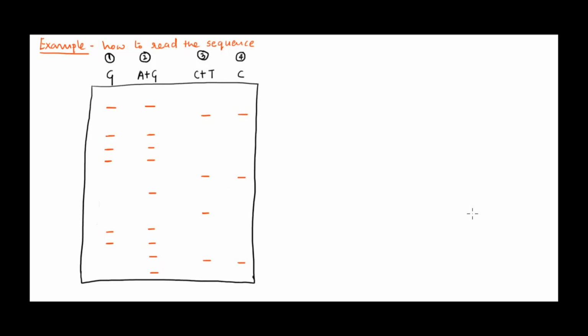But how to read it? As I said, the shortest fragment, as the fragment is short, you will find it at the bottom of the gel. We know this because the size is small.